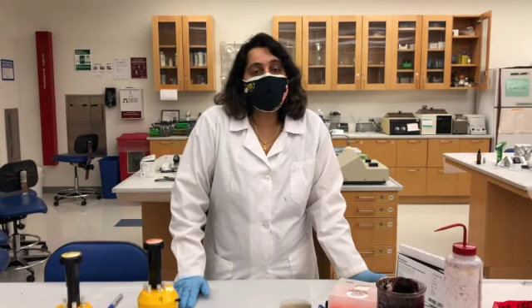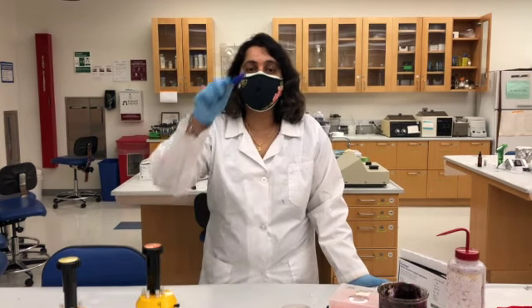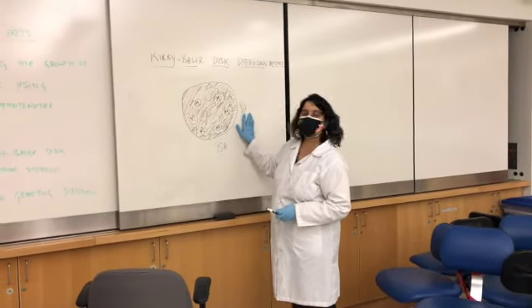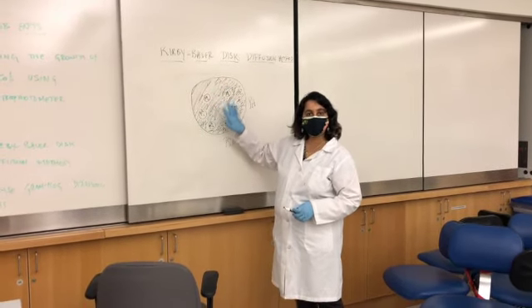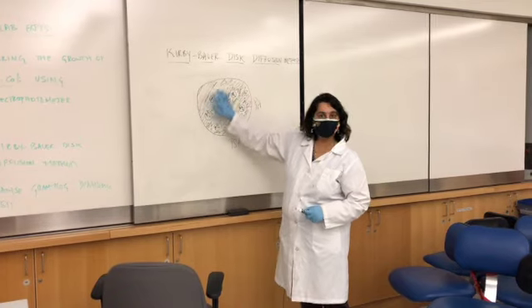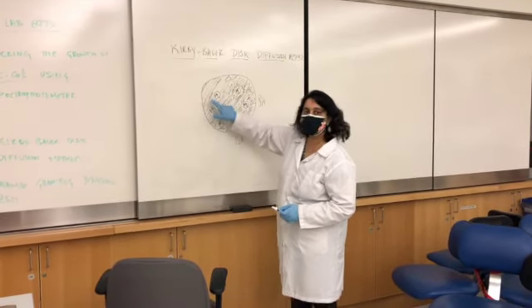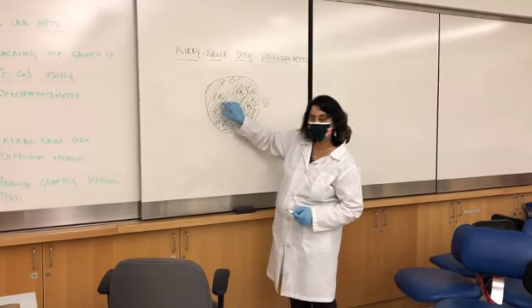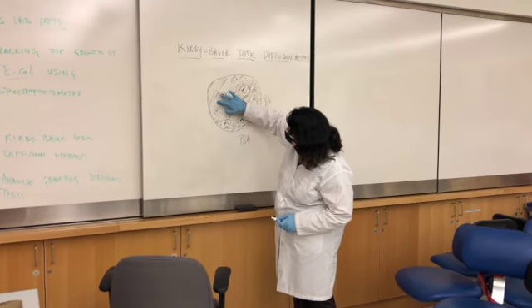If the bacteria is sensitive to that specific antibiotic, what's going to happen is you're going to get a zone of clearance. You have the TSA plate and you added the Pseudomonas bacteria, you heavily swabbed it. After 24 to 48 hours, you will see visible growth as a lawn of bacteria. Then, as the antibiotic diffuses into the media, it would start killing the bacterial cells around it.